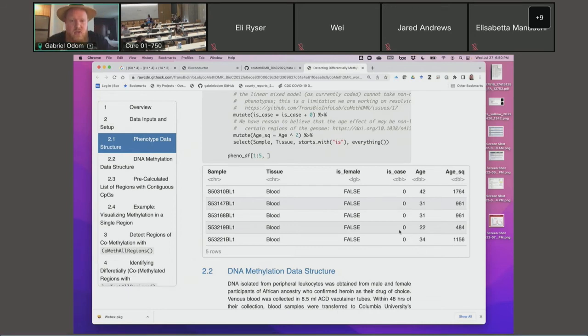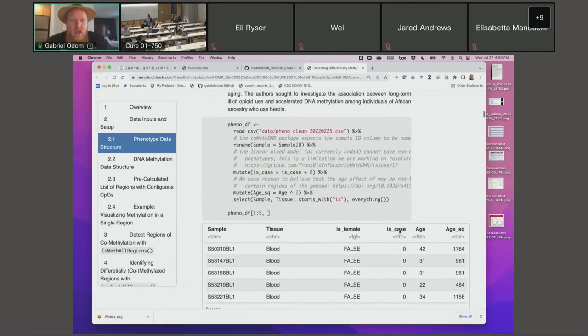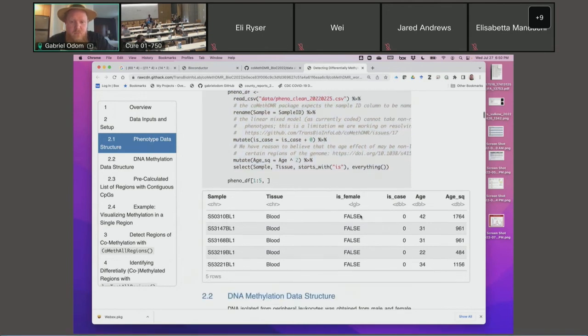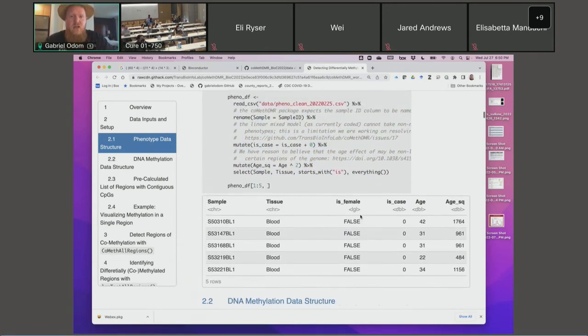Some of the literature — particularly coming out of Steve Horvath's group, the famous epigenetic clock — found that the age effect on DNA methylation is often nonlinear. So we're actually including a square of age in our model as well, but we'll get to that shortly. Anyway, we can run this code if you're interested. If not, just follow along — that's okay.